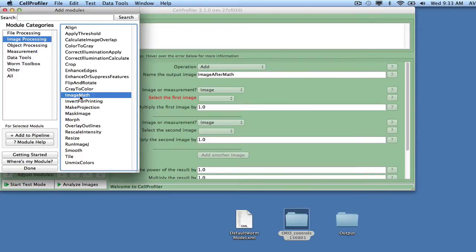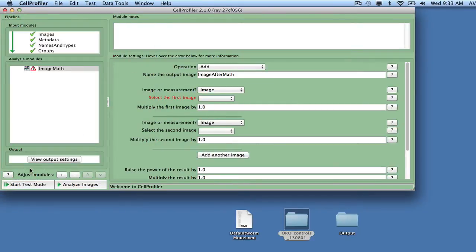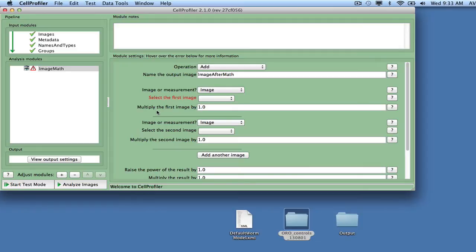Add the module by selecting and double-clicking it. The module has now been added to your analysis pipeline. When the module is selected, its settings are shown on the panel to the right where they can be adjusted.